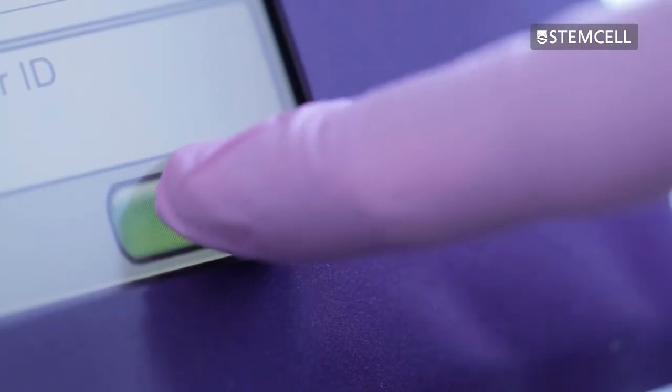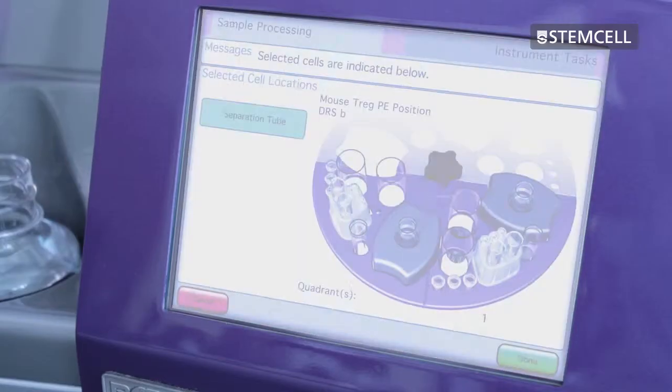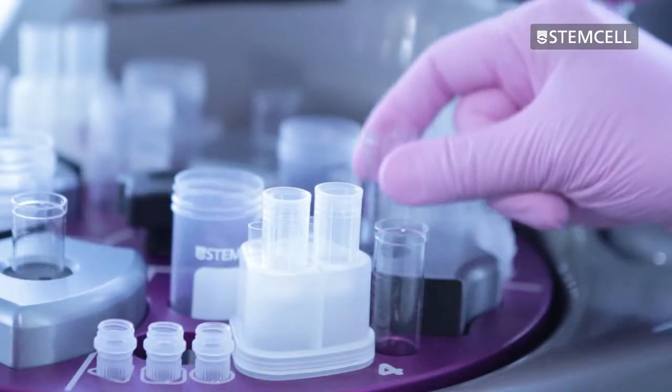When the run is finished, press unload. A screen will appear in which a green circle will highlight where your desired cells are located. Cap and unload these cells.